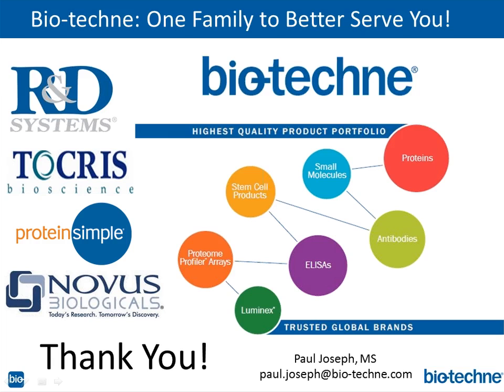Yes, you can. In fact, there are protocols online. My email is at the bottom there, and I can probably find you some of those protocols, but you absolutely can. Now remember, PVDF is not brittle, so it's easier in terms of handling.